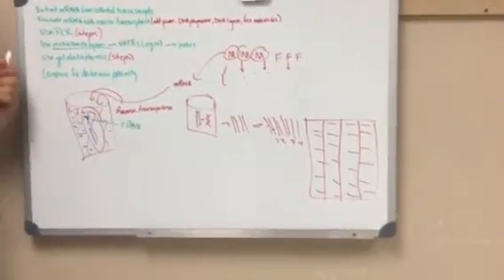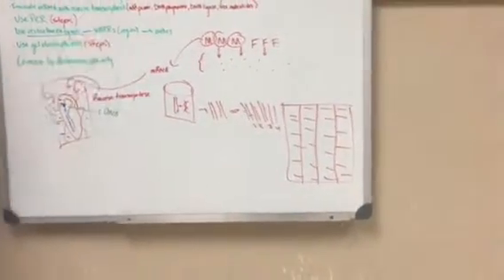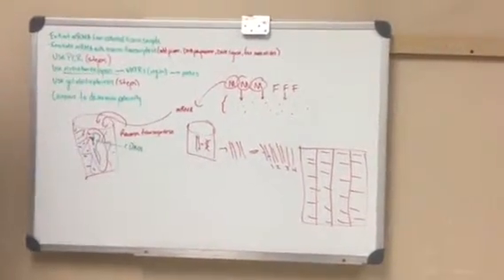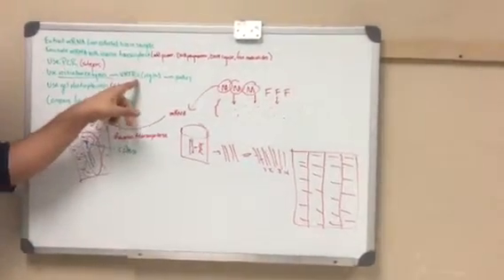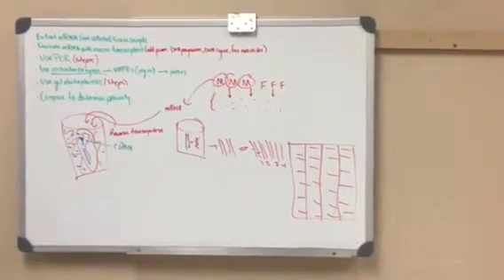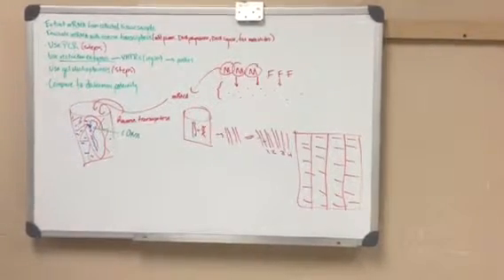But these restriction enzymes, we specifically chose them so that they can target VNTR regions, which are variable number tandem repeat sections of DNA. This is significant because we need to use those to identify paternity. This is because these VNTR regions are very specific to the organism or the individual, so we can tell differences between species or even the same organism.